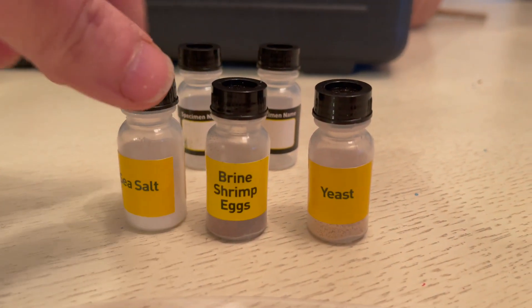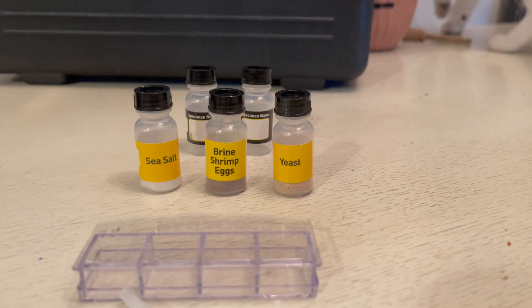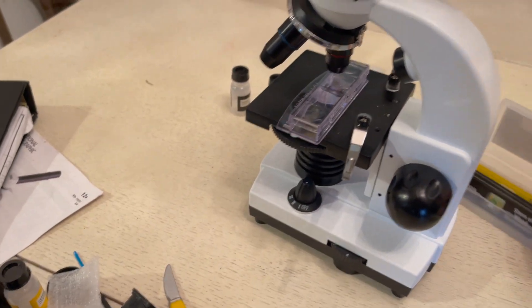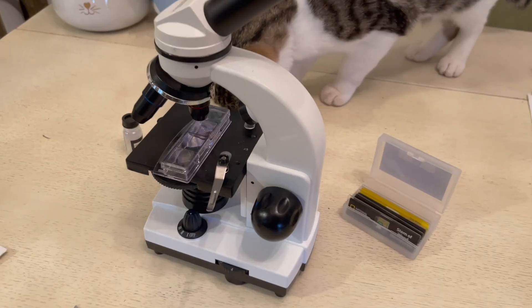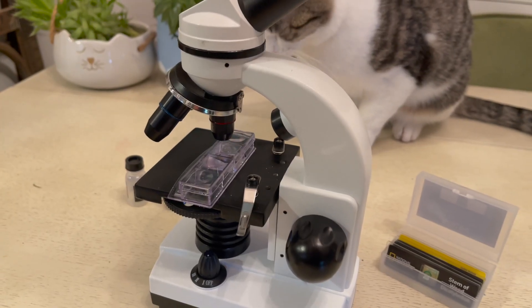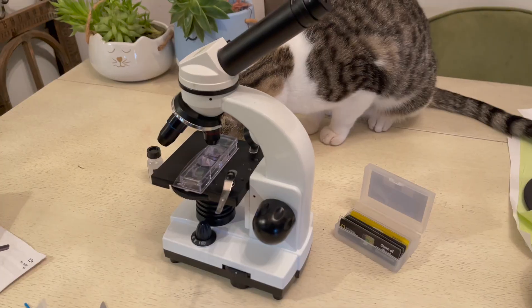I was most excited about seeing the brine shrimp eggs underneath the microscope. Growing up, comic books had advertisements for sea monkeys, which are technically brine shrimp eggs. There's a hatchery included so you can put a bunch of eggs in, watch over them, and when they hatch you can look at them under the microscope. I haven't successfully hatched any yet but I'm going to keep trying.